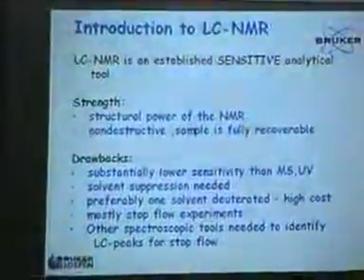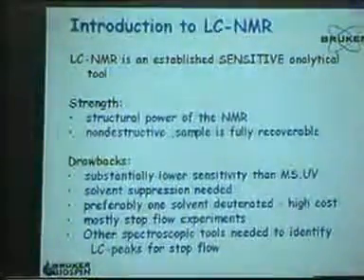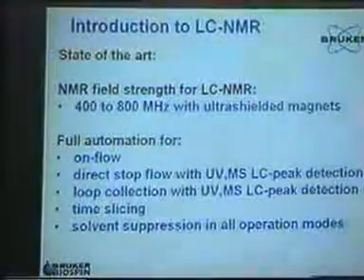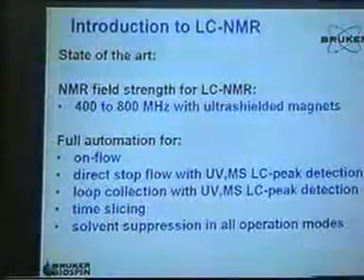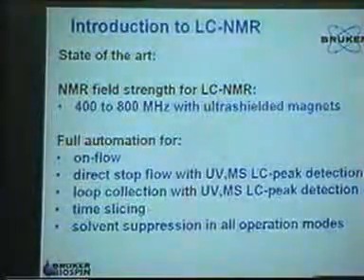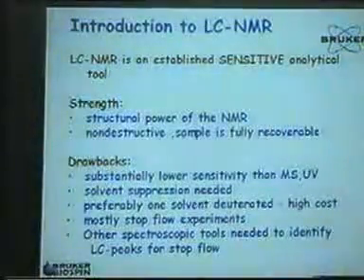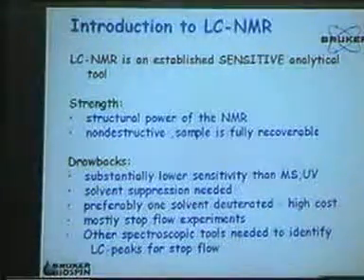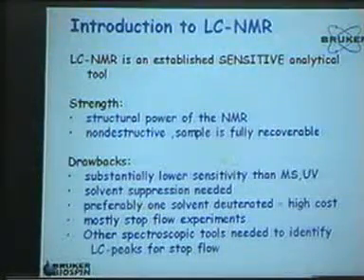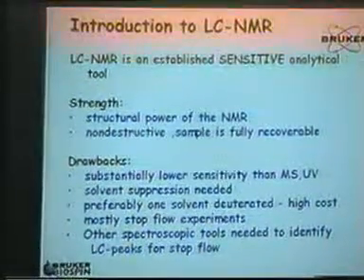Okay. So, since the beginning of my talk, what did I explain? I explained that we got higher magnets, higher sensitivity due to probes, and better consoles because we have to. This allows us to introduce NMR into a completely new world. For many years, there was the possibility to couple liquid chromatography and mass spectroscopy, which is really interesting for chemists.